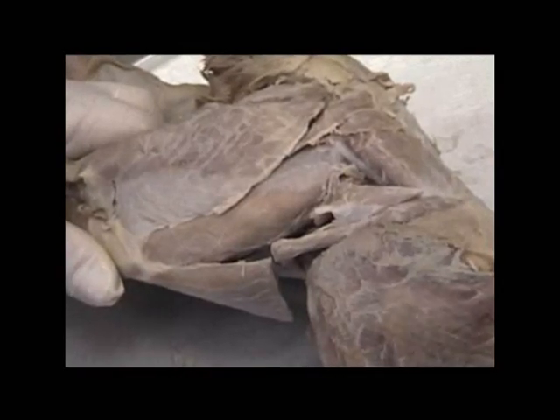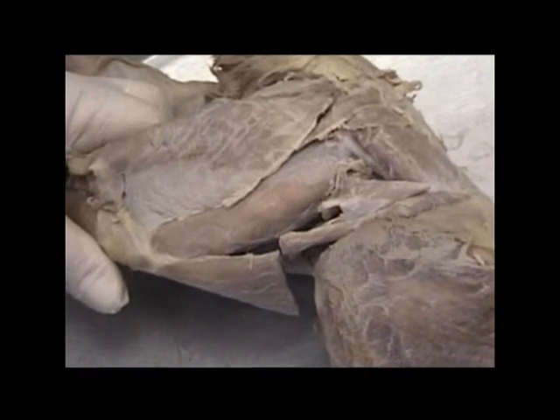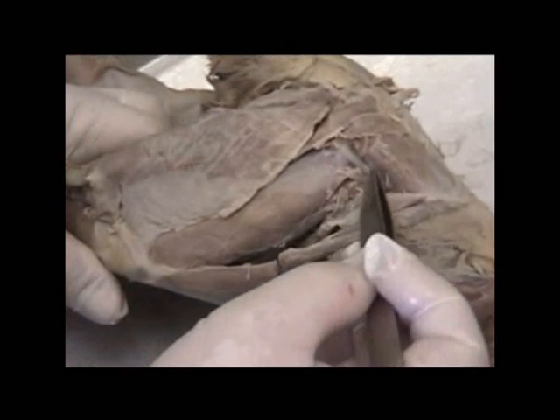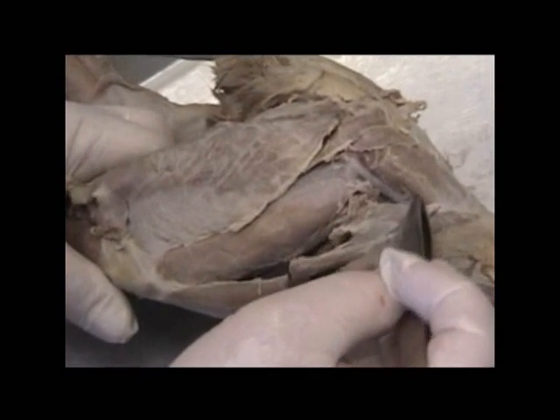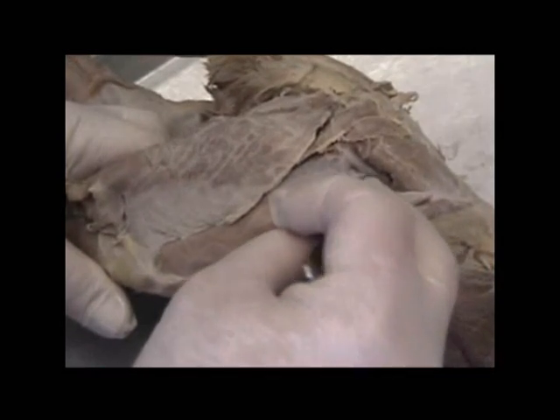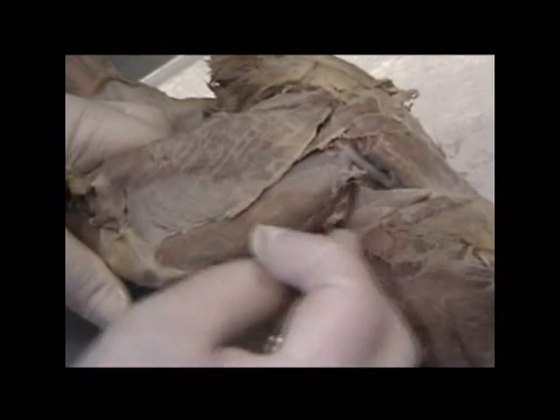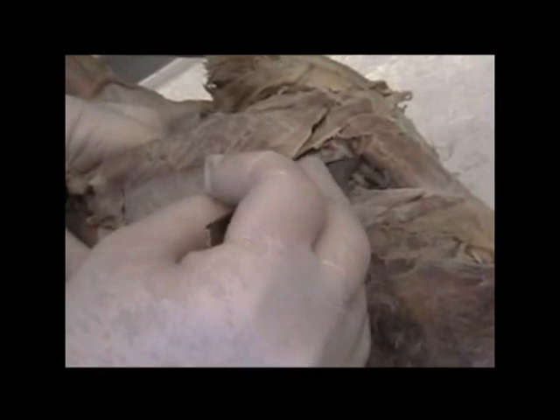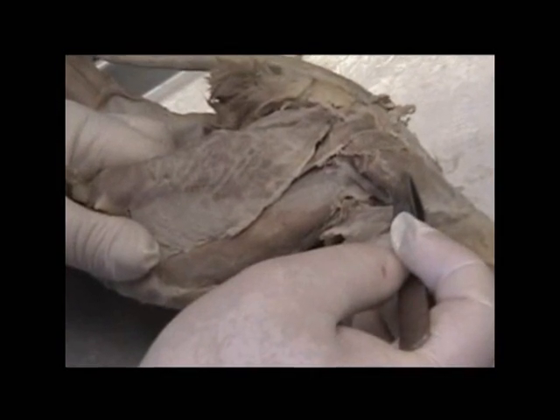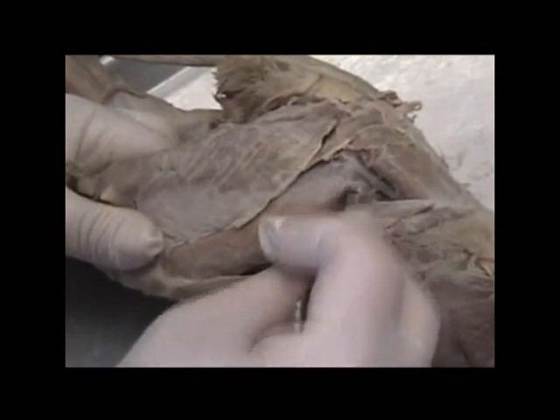What to do is roll the animal up a little bit onto its side, and we pulled the tensor fasciae latae down, pulling up on the gluteus medius right here. We find underneath that is going to be the gluteus minimus. Seems to be running at this type of an angle, sometimes sausage shape, and so we see that there: gluteus maximus, gluteus medius, gluteus minimus.